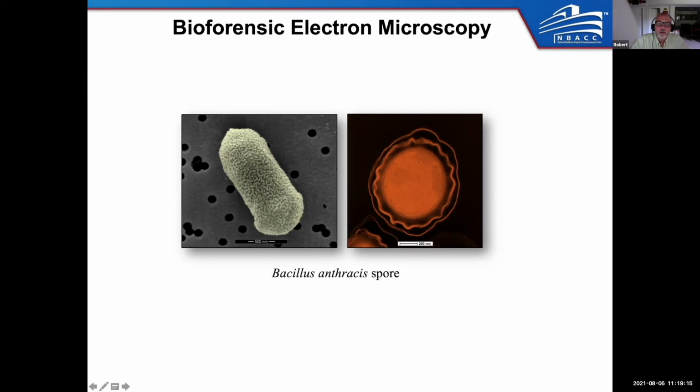Okay, so one thing that we did when we set up our facilities was we procured known traceable samples of all hazardous organisms, and we imaged them the exact same way. So that when I tell you this is actually a picture of an anthrax spore, I actually have a certificate of authenticity and proof that what I'm showing you is actually what we have. For all hazardous organisms, we have all these images, and we have all these certificates, and we have proof that when we show you something, it actually is what it is.